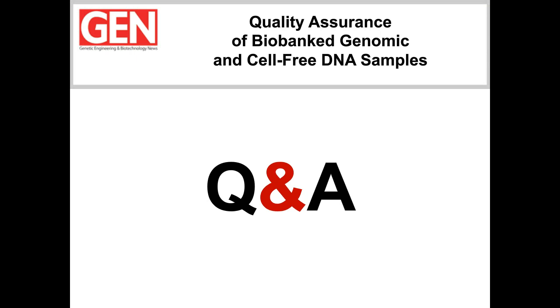Okay, great. Thanks, Rainer. I think we have a couple more questions for you, so stay with us. One of our audience members would like to know if the TapeStation can be used for accurate quantification of cell-free DNA or library DNA. Yes, of course. Cell-free DNA depends a bit on the kit that you are using. We have shown data here during the webinar that have been done with a high sensitivity D5000 application.